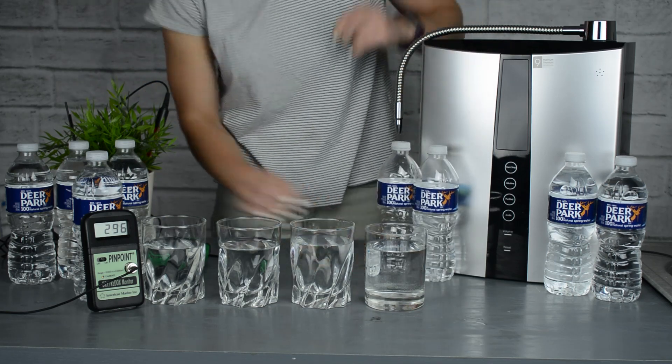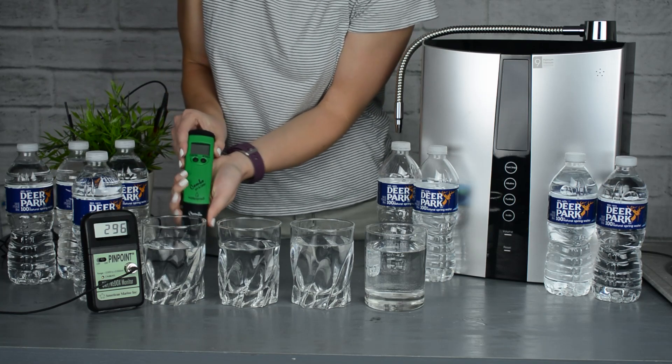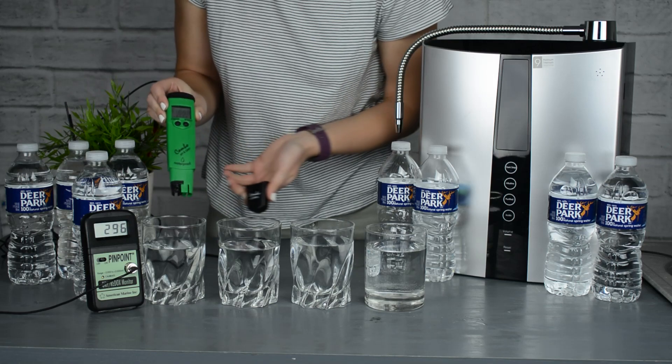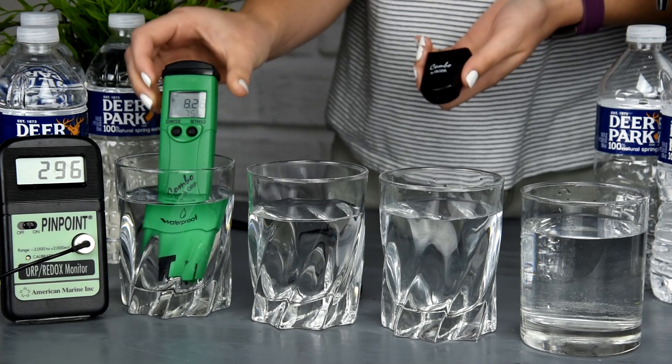The first thing we're going to use to test the water is the digital pH meter. We're going to turn it on and stick it inside the first cup, and as you can see the pH starts to drop and gets to about a 7 pH.